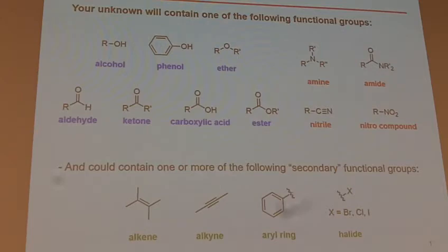We're going to add to that toolbox, you're going to collect a proton NMR spectrum. So we'll show you this week how to prepare that sample, and then we'll run the sample for you, but then you will actually work up the data for it. And then we also will collect GC mass spec data for your unknown, okay? And so with those three pieces is information that will help you figure out if you have an aromatic ring or not, all right?